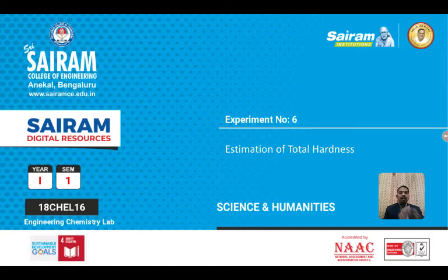Before going to how to do the experiment and before we discuss what is total hardness, let us talk about what is hardness. Hardness is related to water, isn't it? Today we are going to estimate total hardness present in the given sample of water. So why is hardness important? If water is hard, it does not give lather easily with soap. So if water is not giving lather easily with soap, it is called hard water.